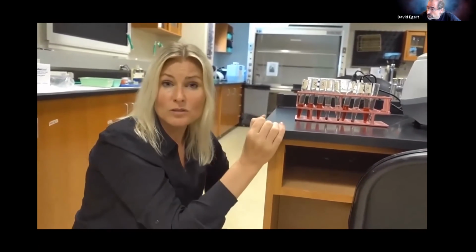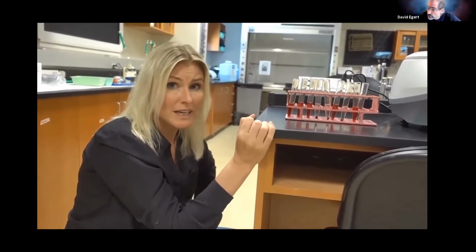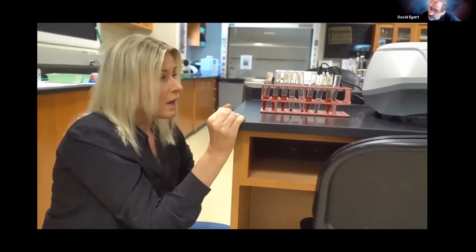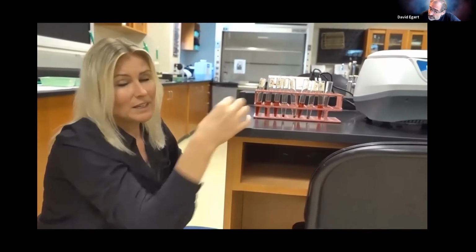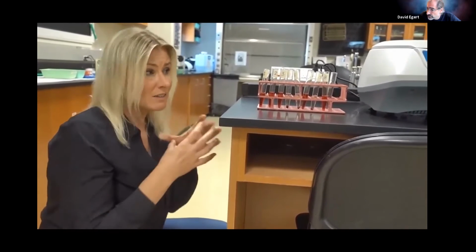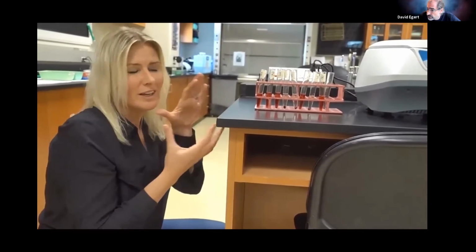pellets under the microscope to actually figure out if they crenated or if they're just the same as they were before. Because remember, they get pink when the cells actually lyse and we get the hemoglobin out there. But when they crenate or they stay the same as they were from the beginning, that's not going to be indicated by your supernatant. And so in those cases, we most certainly should break out the microscope and take a look at them and see if they're actually swelled up, or sorry, shrunken up, or are the same.